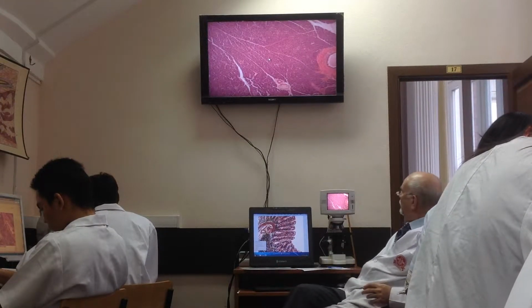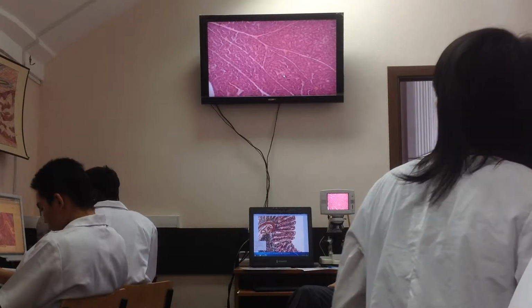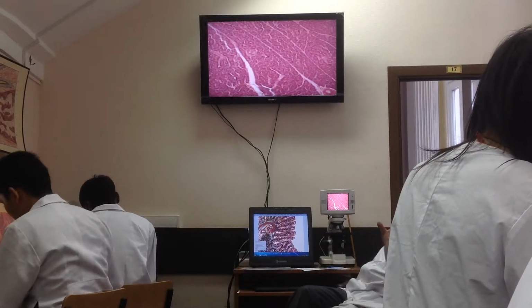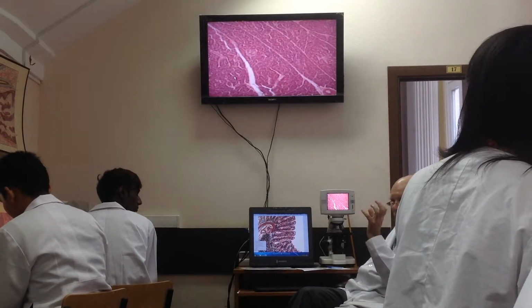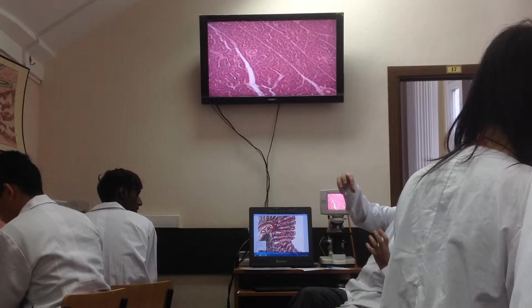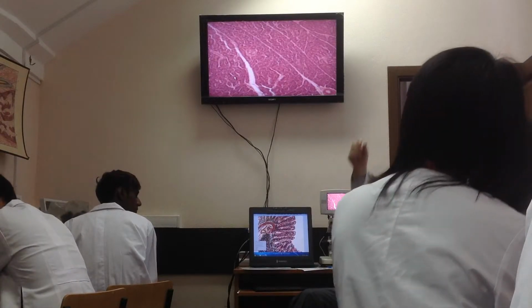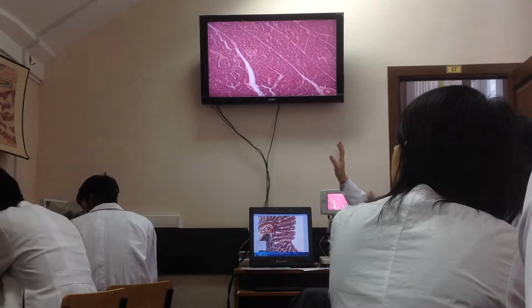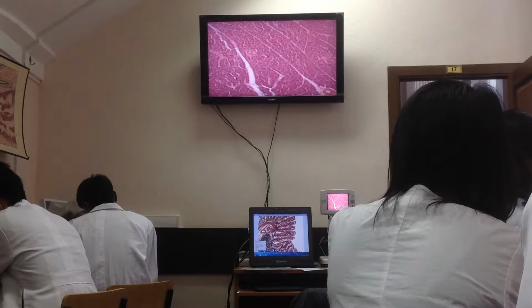At closer magnification, we can see that acini, or secretory portions of this gland, remind of sacs, not tubular. It's more often alveolar, or tubular, elongated sacs. So tubular-alveolar, but not purely tubular. In the stomach we saw real tubular glands. Do you remember? Here, tubular-alveolar. So the gland is compound, tubular-alveolar, and ramified, because compound glands are more often ramified.